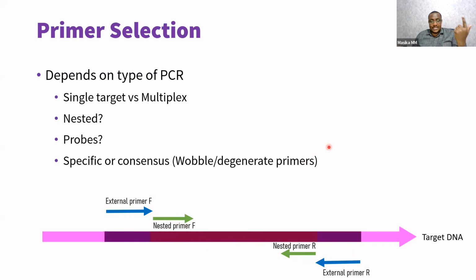So you have run this PCR, basically one PCR completely, which is maybe 35 to 40 cycles or even 30. And once you have interpreted your results or you have not interpreted them, you just have the product, you can get that product and run a second PCR with nested primers like these ones. So this allows you sometimes to increase the specificity and also to detect, because now this next primer will have a lot of templates. Remember, you have 68 billion copies. So it is able to detect something that may not have been plentiful in the initial stages of the first PCR.